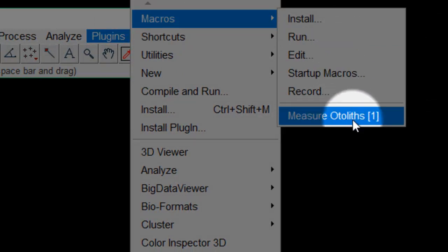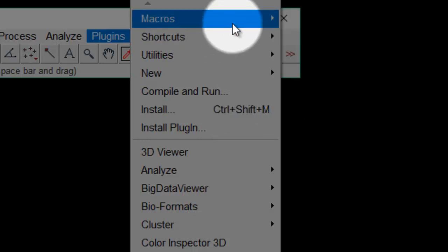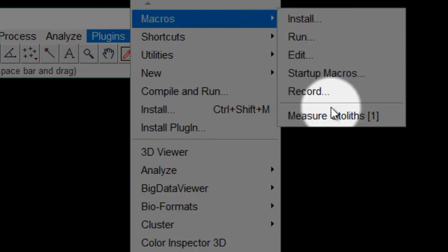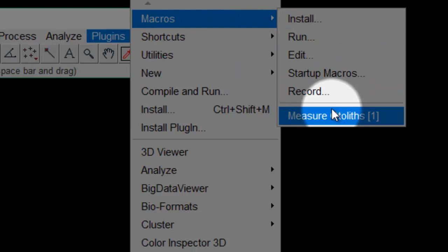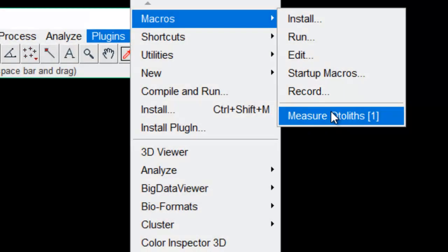You'll notice that MeasureOtoliths has a little number one in square brackets. That means a shortcut has been set on the keyboard. So to run the macro, all we have to do is hit the number one on the keyboard instead of clicking through the menu — it's a lot easier.